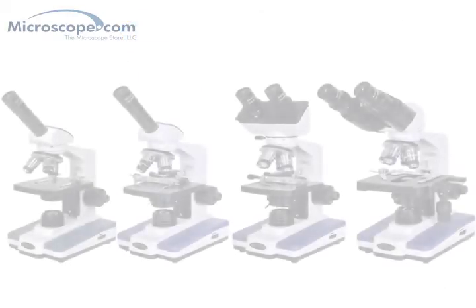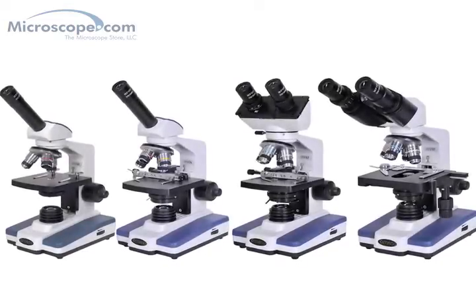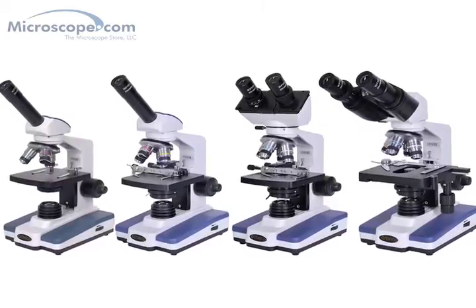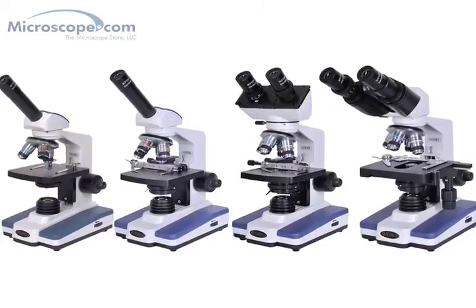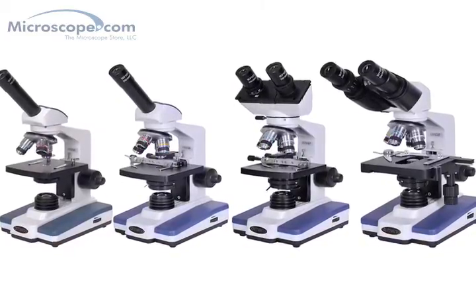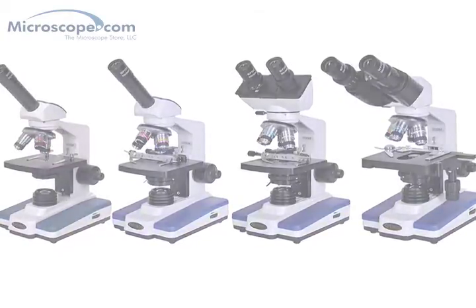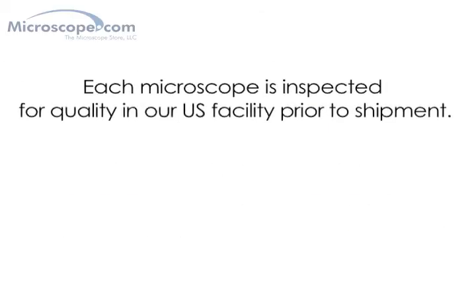In summary, the Omano 118 series offers an excellent choice of entry-level full-size microscopes in both monocular and binocular configurations. We recommend the monocular versions for elementary through middle school and the binocular models for middle school, junior high, and high school students. These systems give excellent performance value for their low cost and are recommended for any student or home application where a solidly built basic compound microscope system would be appropriate.